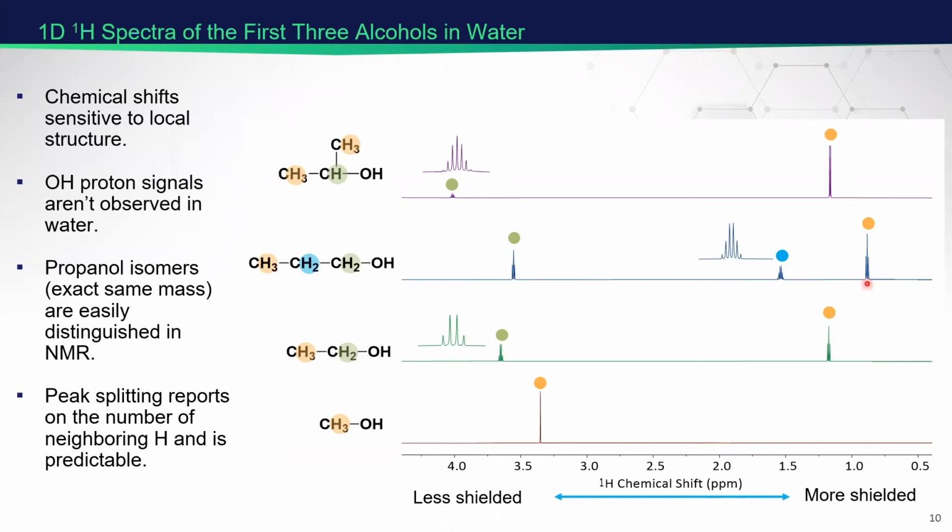This fine structure is very important in NMR. And then finally, moving up to the isomer of propanol, we're back down to two signals, because these methyl protons, on average, experience the exact same environment. And so they contribute to one signal, which is split, this fine structure. And the methine is up here with the highest deshield value in the spectrum.